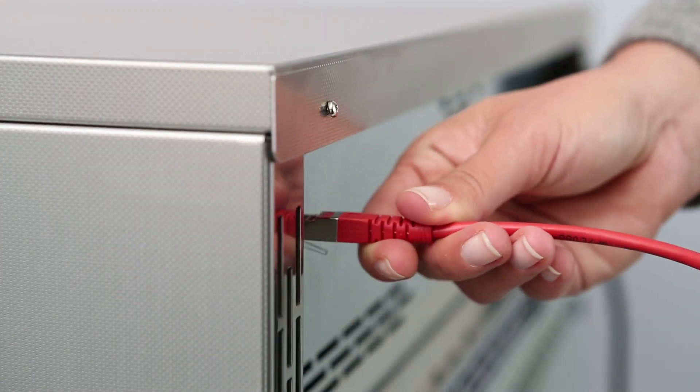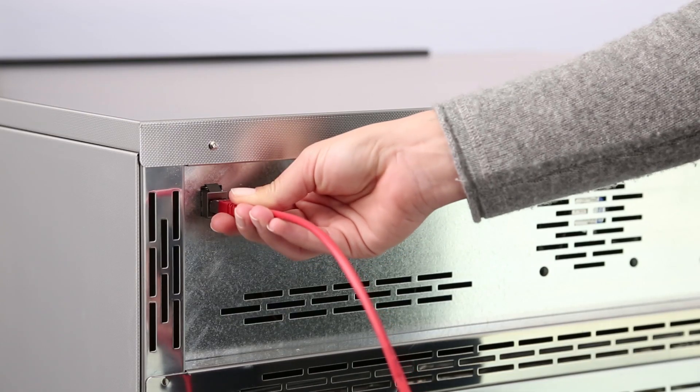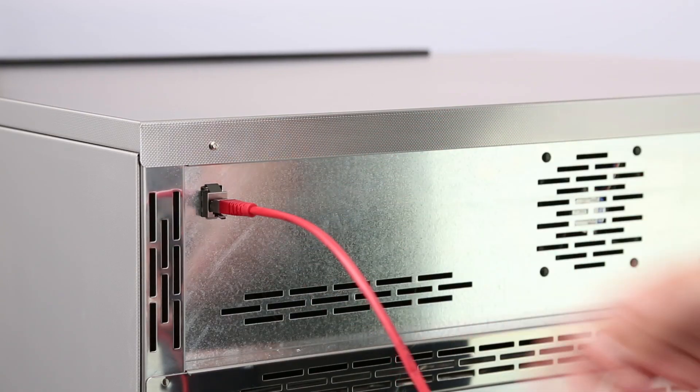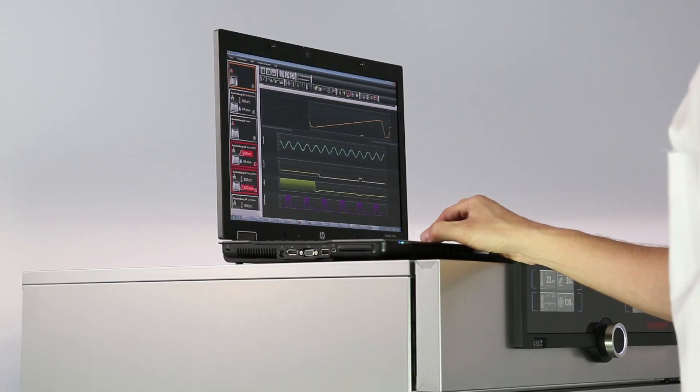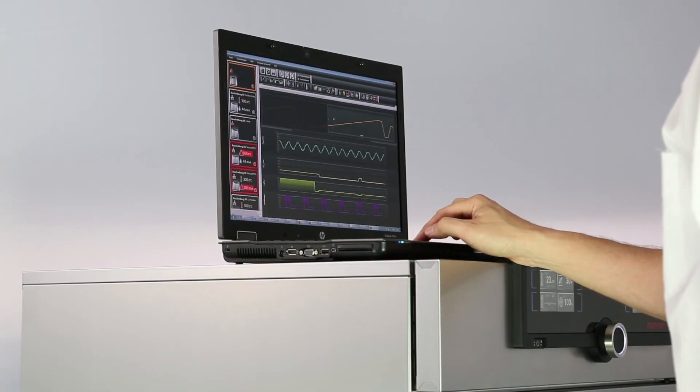Ready, steady and your ethernet connection is all set. Quick and easy operation, maximum comfort.